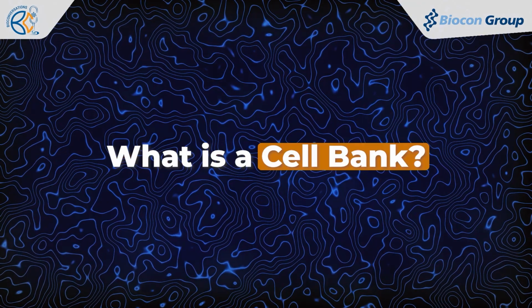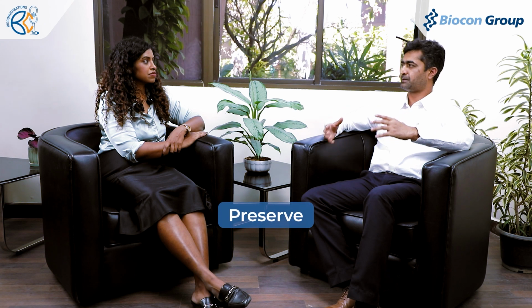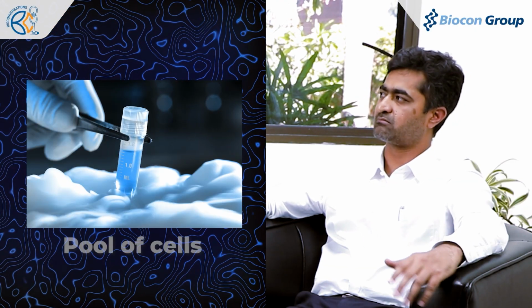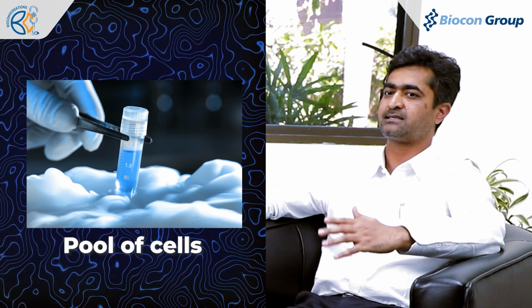So, can you break it down for us? What is a cell bank? So, cell bank is a technical term, but ideally in biologics manufacturing, cells are the starting material, and hence it has high value, and hence we need to preserve them. And cell bank is synonymous with preservation. So, a cell bank is a collection of a homogeneous pool of cells placed in an appropriate container. And each container contains a pool of cells that is in a healthy state.